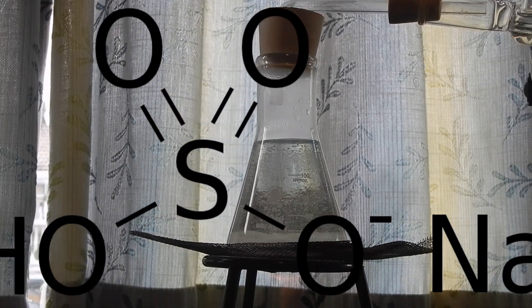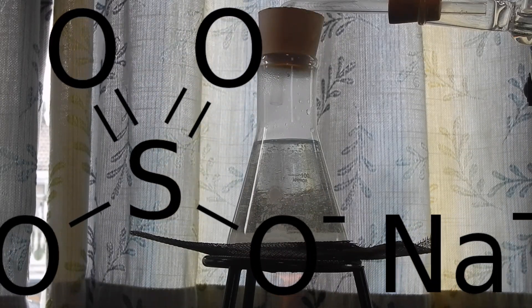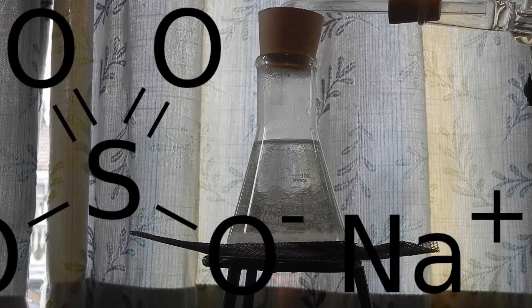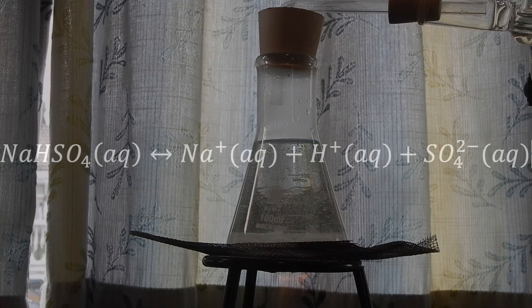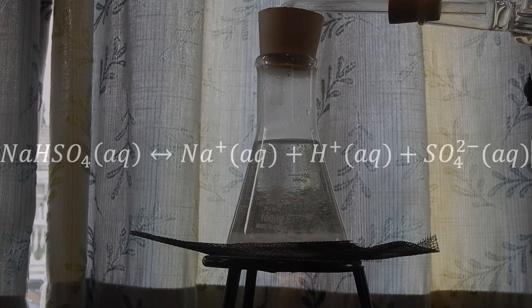The sodium bisulfate, NaHSO4, has a hydrogen in its molecule that is able to dissociate into hydrogen ions. Therefore, it has a strong acidity, and is commonly used as a substitute of sulfuric acid.